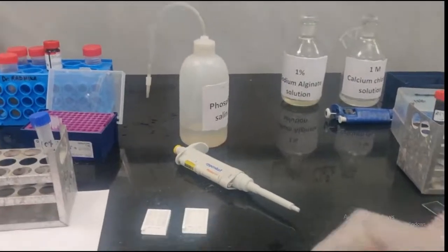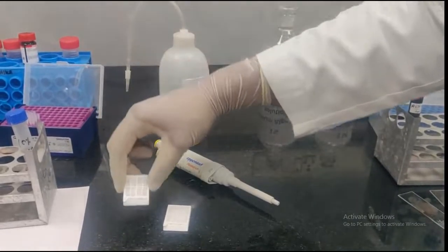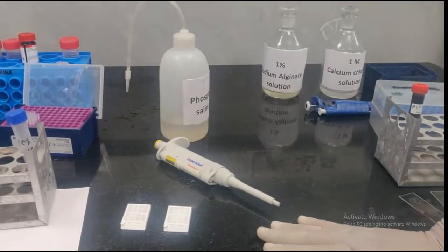So we can see now our cell blocks are ready to go into the tissue processor, and this entire process has taken around 25 to 30 minutes.